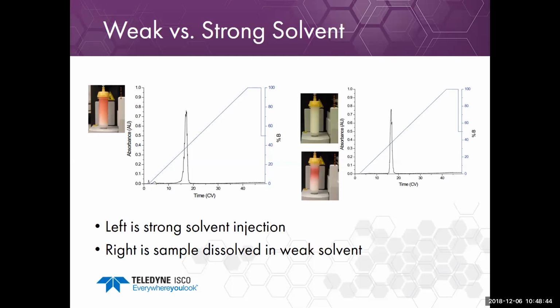Oh man, I'm having a brain freeze right now and I apologize. Send us your email and I'll send you a reply when I get the memory. Parabens, I'm sorry. Some of the parabens make very good test compounds because they also allow you to look at the state of the silica. And I like to run those isocratic because running isocratic tends to show problems with the column better than running a gradient.